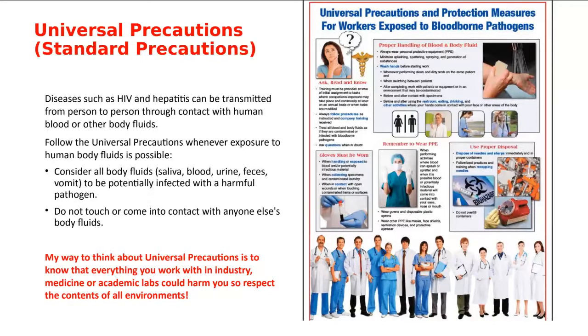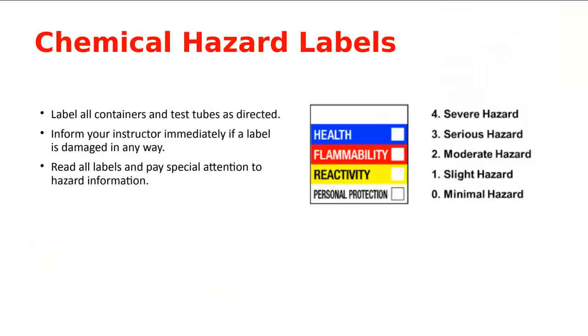All right. Getting back to hazardous communication, that's 3 times I brought it up, right? It's going to be important. You'll see it again. But you'll see that everything that's in our lab is going to be labeled with these hazardous communication labels. I will tell you of things that we're using that are potentially dangerous before we start lab. I'll have a little huddle period where the whole lab gets together, and we talk about what those hazards are and what the pitfalls might be.